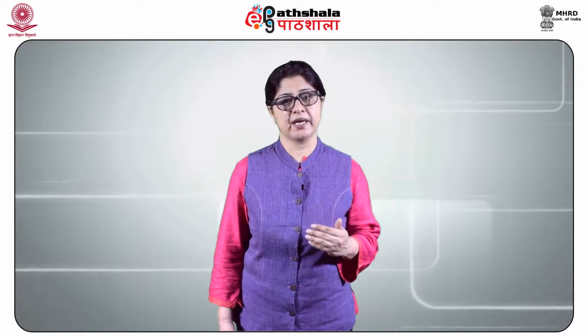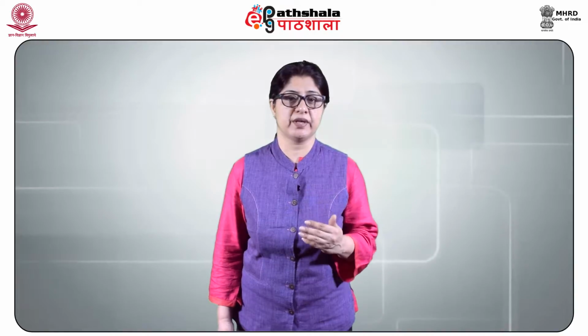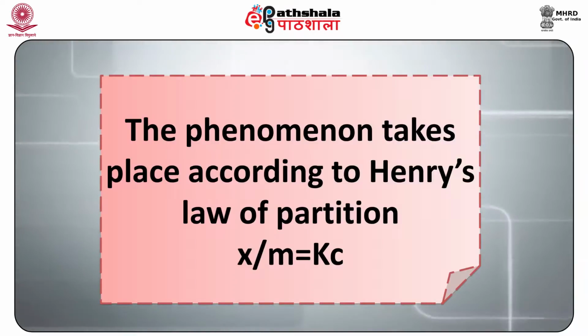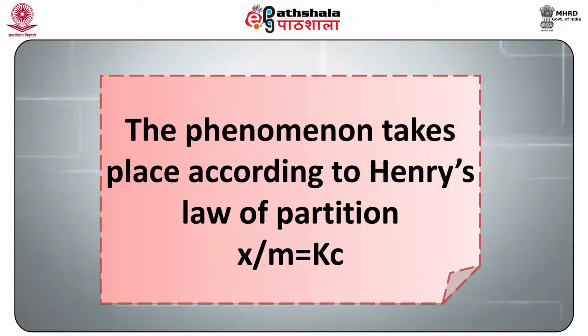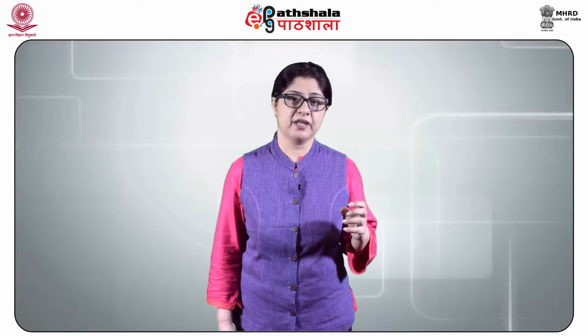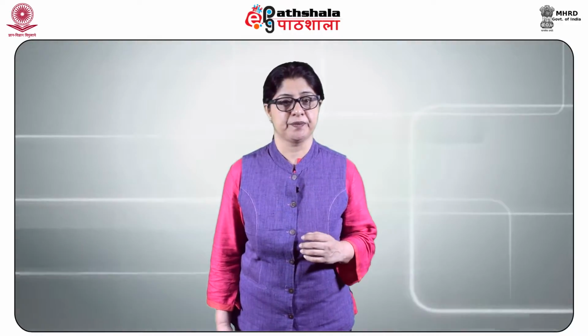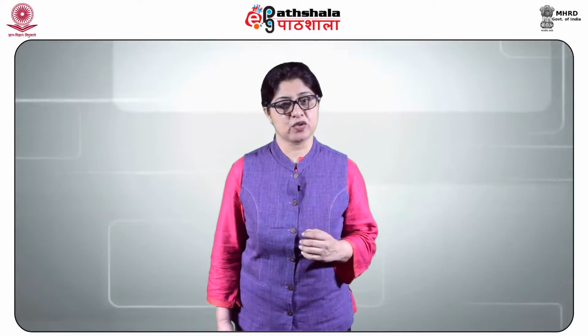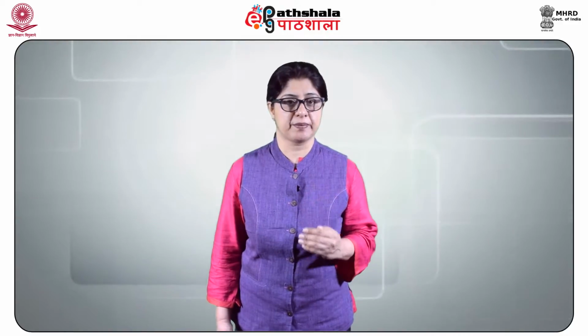Similarly, if the vapor or gas comes in contact with a liquid, a fixed quantity of the gas is dissolved in the liquid. The phenomenon takes place according to Henry's law of partition, that is x/m = kc. Both phenomena are selective and there are different k values for different vapor-sorbent pairs. The principles of gas chromatography can be explained in terms of the following experiments.